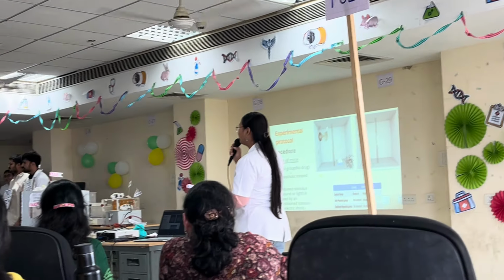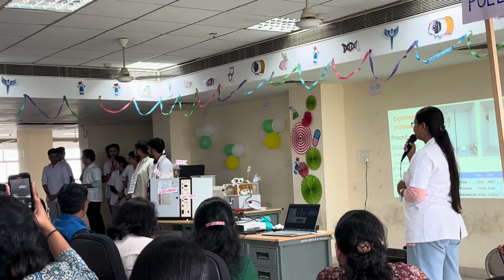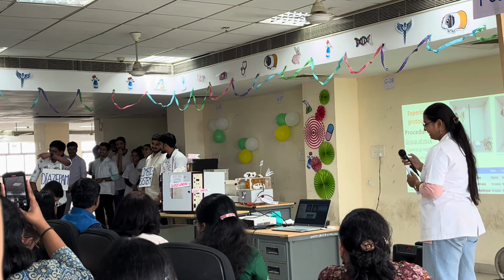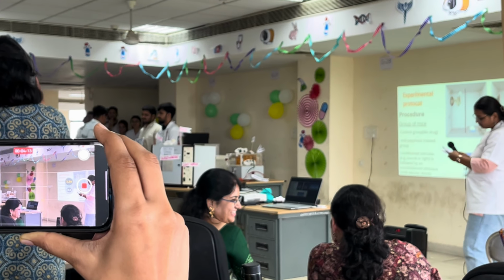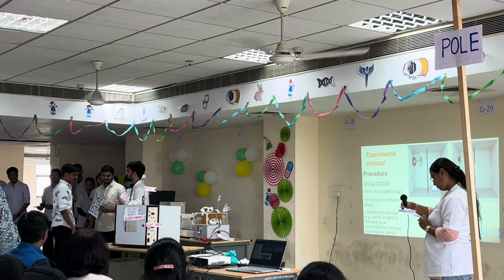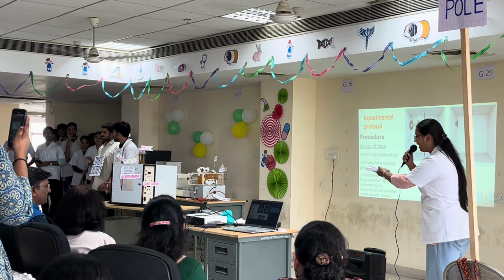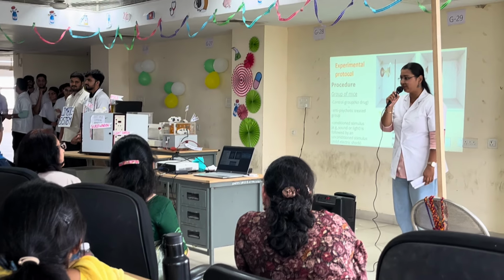And then we have the star of our show, which is diazepam. As you can see, diazepam did inhibit the brain's higher functions and limbic system. So that was the reason the mouse did not climb the pole and did not give a positive response.